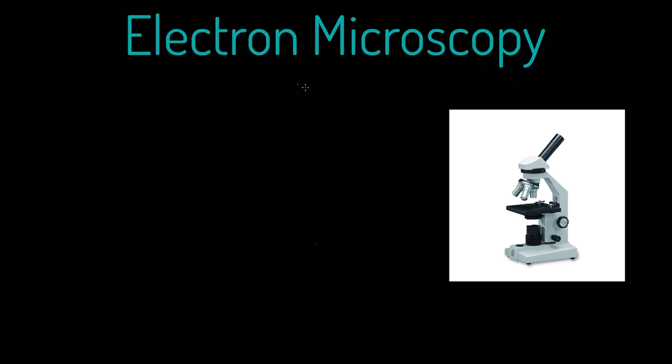Now, we're talking here about the process of using a microscope, okay? So there's certain features of that, and we'll get to the electron microscopy in a moment, but for now, let's remind ourselves of what we're probably quite familiar with, which is what we would refer to as a light microscope. Let's remind ourselves quickly of how that works, so that when we look at the electron microscope, we can see distinguishing features and differences. All right, so let's do that.